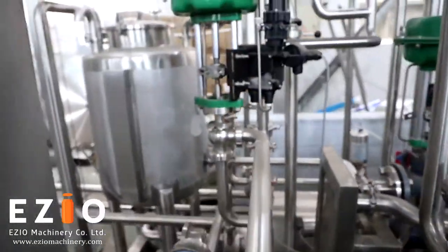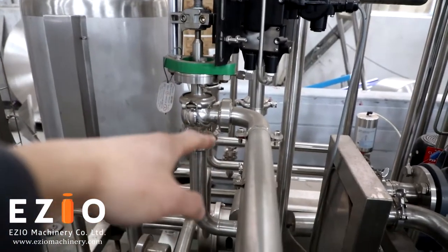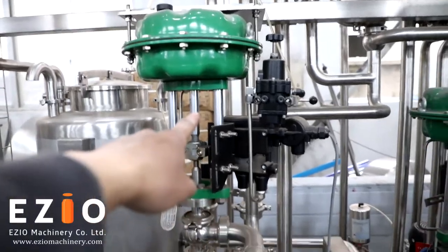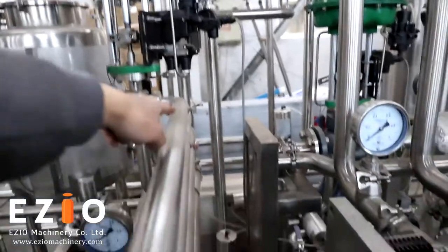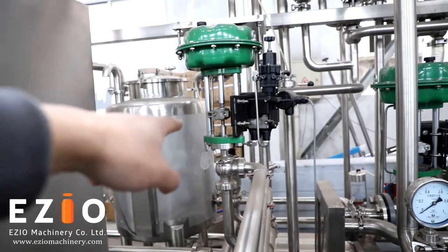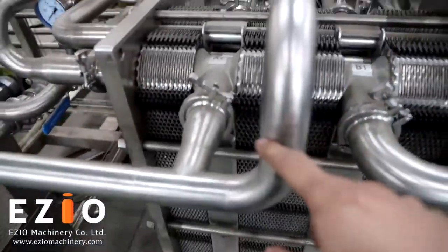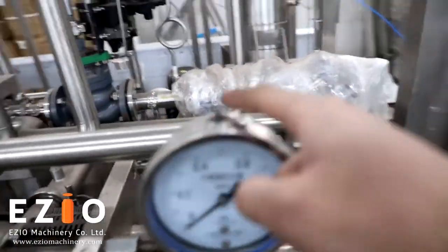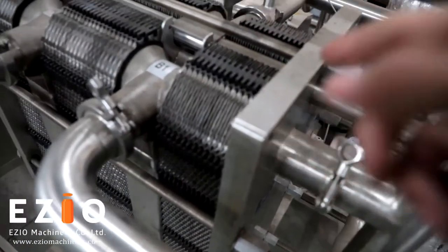We need to preheat the product first and then do pasteurization. There is another way to pasteurize the heat exchanger from the product tank — from here. These are additional electrical valves to control: one is for steam, and one is for your product. The product comes from here and goes in.